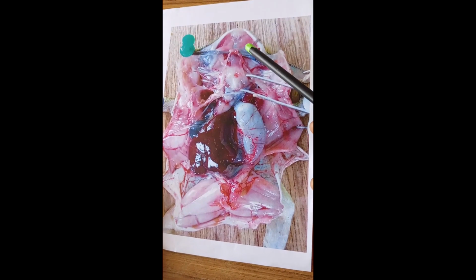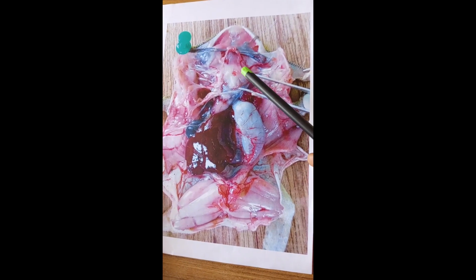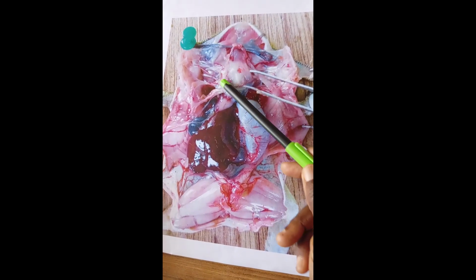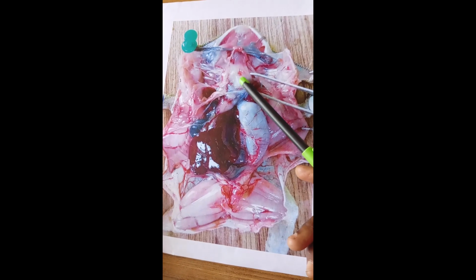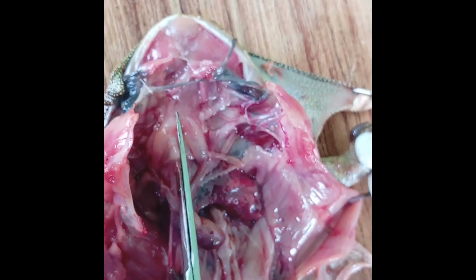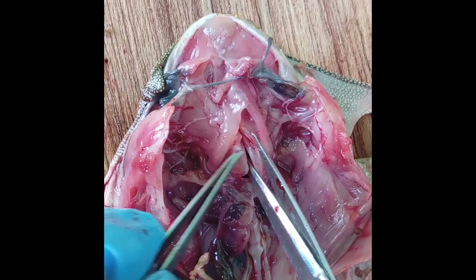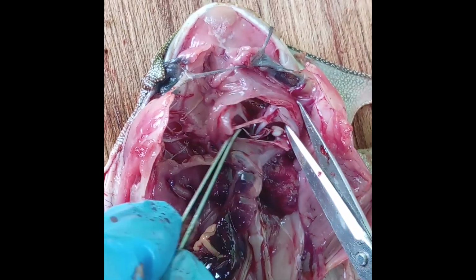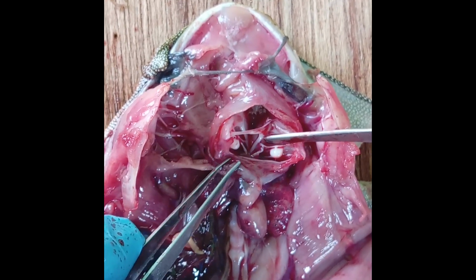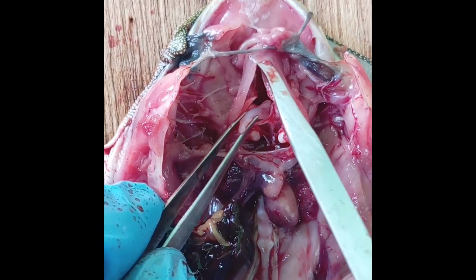So here we have the toad, the ventral body cavity is opened, and we discussed how to do it in earlier videos. Please check. Here is the laryngotracheal chamber where sound is produced and which is also a passage for breathing. So we are opening up the laryngotracheal chamber to see the contents. Here, very lovely structures. We are going to name them, but look at how the structures behave as the chamber is manipulated.